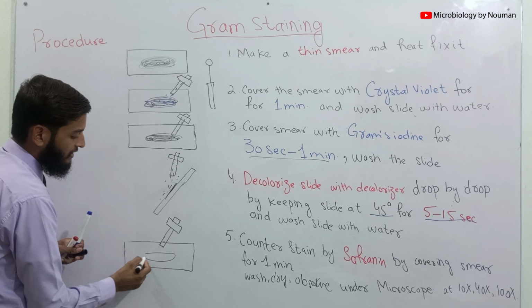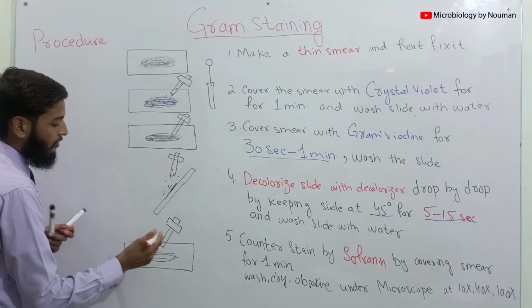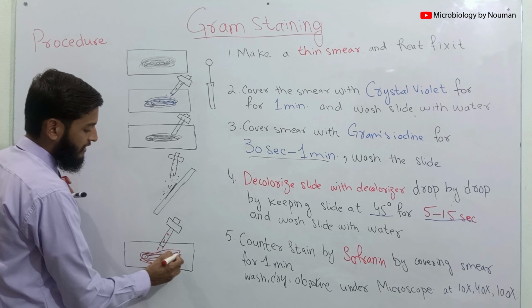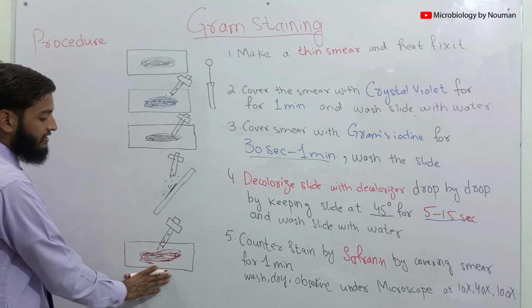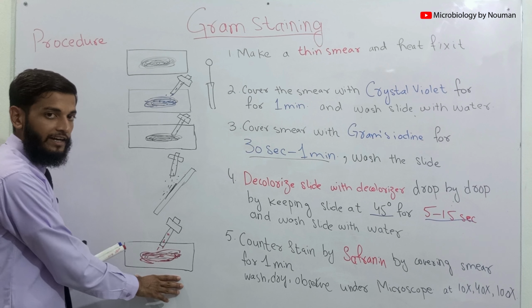Then this was our smear. We will cover our smear with another dye. We call it a counterstain, safranin. We will cover our smear with safranin for 1 minute. So after 1 minute, we will wash our slide with clean water and we will let this slide air dry.